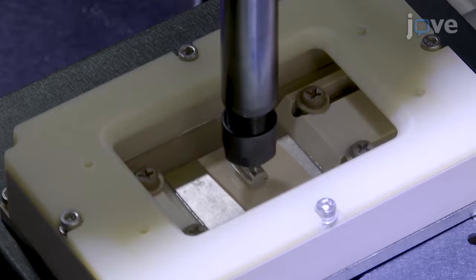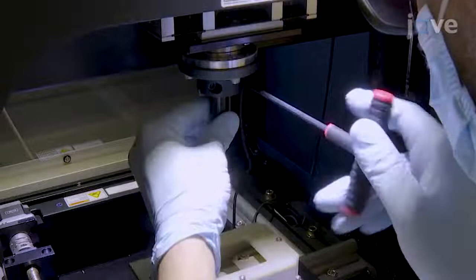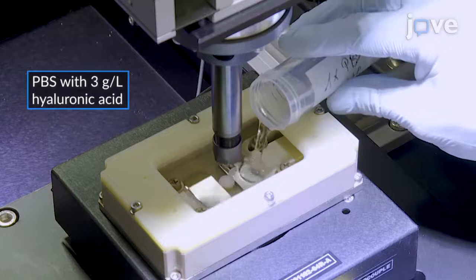Mount the cobalt chromium molybdenum cylinders onto the upper load cell. Add the testing solution into the liquid cell to submerge the osteochondral cylinder and cover the metal cartilage sliding interface. Set testing parameters such as desired normal force, stroke, and sliding speed, which will be maintained throughout the test.